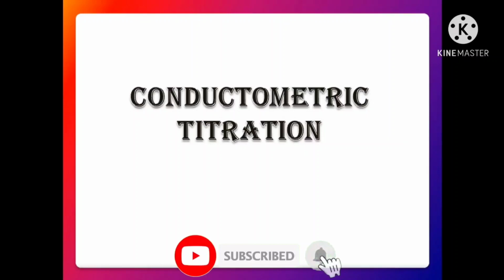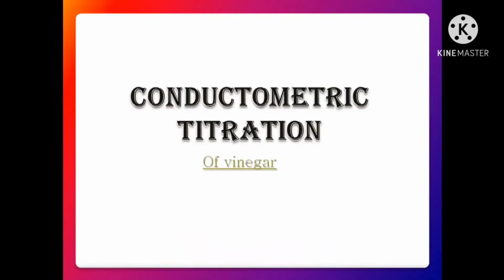In this project, we want to explain the conductometric titration of vinegar. This project was done by Sai Deepak, Srikar, Venugopal and Akhil.